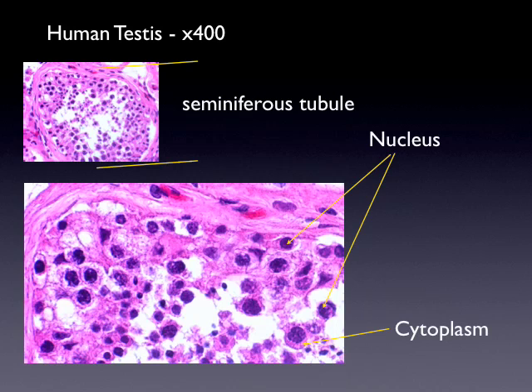At the outside, they've got two lots of every chromosome, like all of our other cells. When they become mature on the inside and turn into mature sperm, they only have one set of genetic information, one set of chromosomes. And they go through a process as they grow in towards the centre, and then they're released for fertilisation.